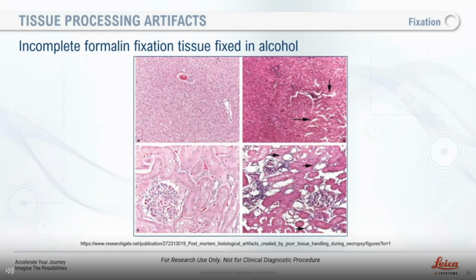Usually on the microtome, you might see thick and thin sections where you might end up on the slide with a thicker section than usual. Usually you're cutting anywhere from 3 to 5 microns, and so the stain is going to be heavier. Also here, and this is a whole other subject, when you have overfixation and overprocessing, you have the possible loss, of course, of bound water.